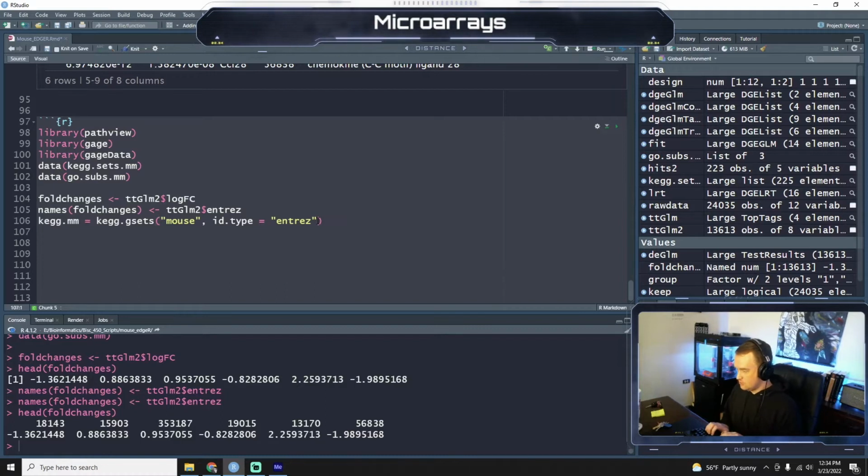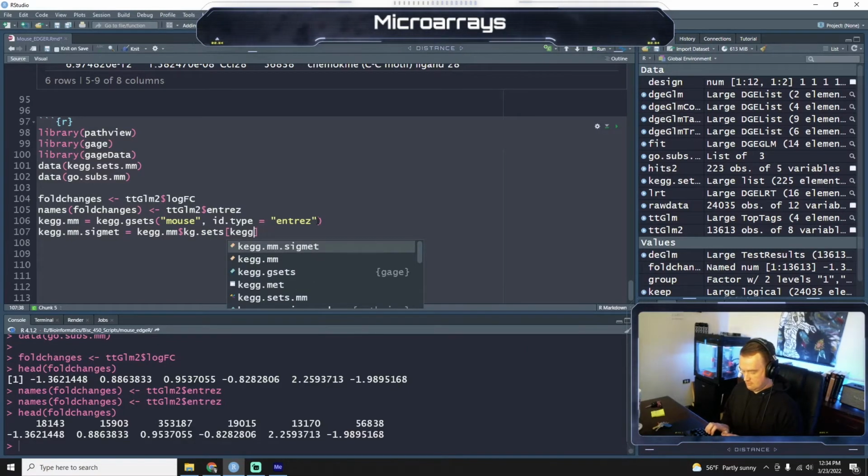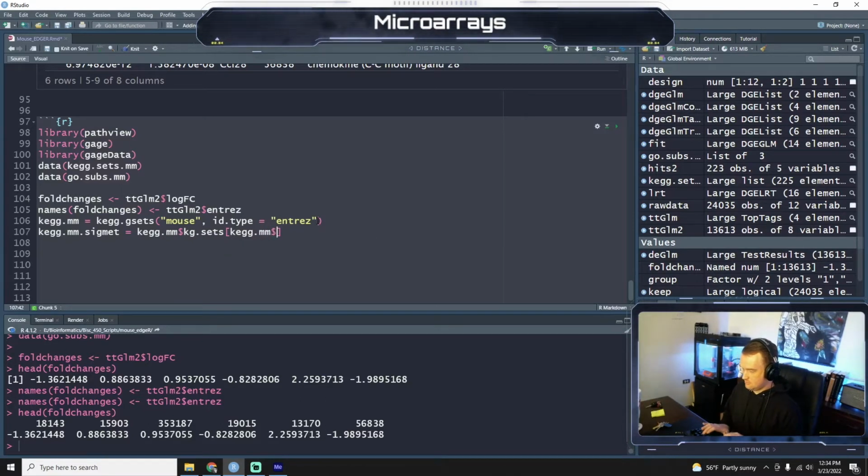And then let's do kg.mm.sigmet equals kg.mm$kg.sets, kg.mm$sigmet.idx.